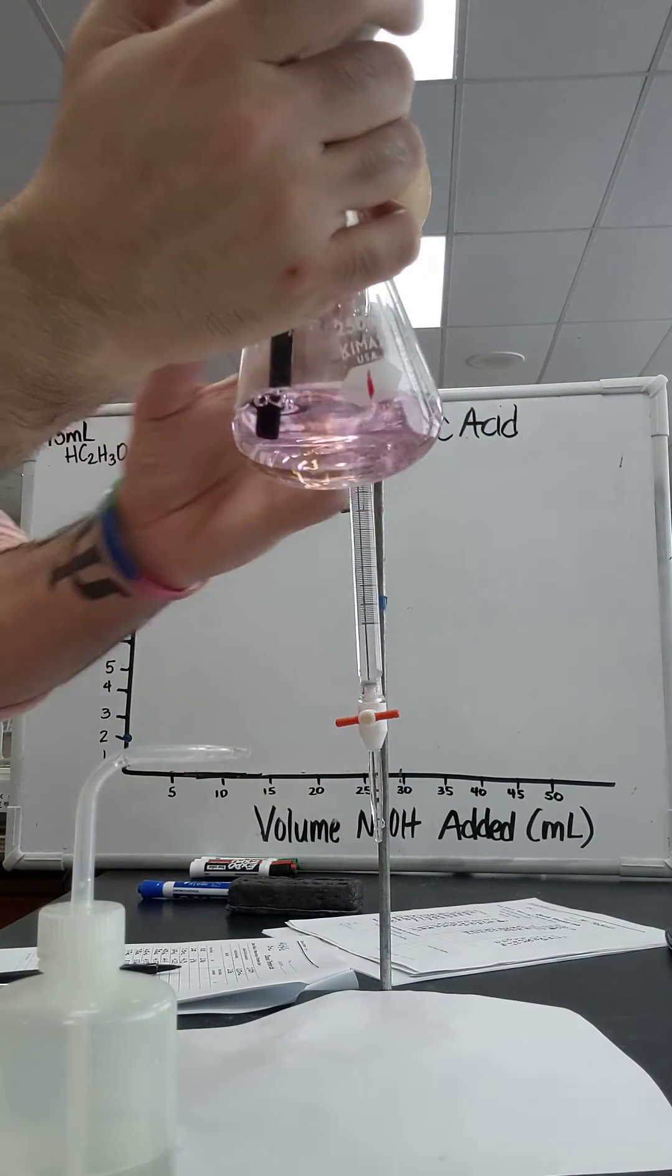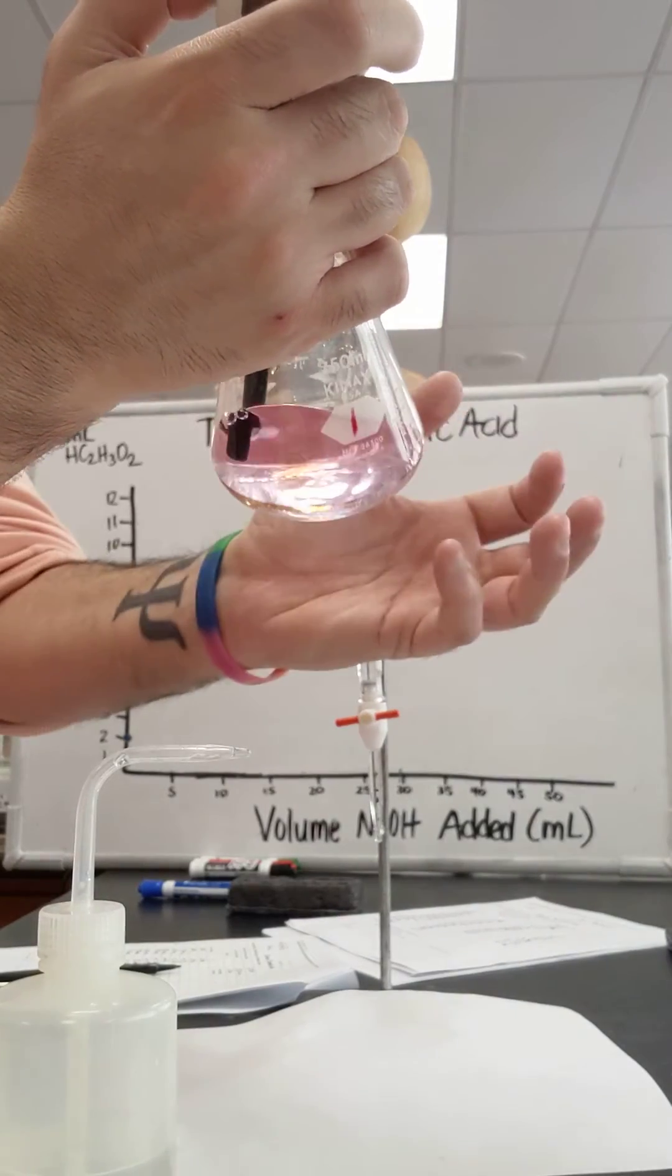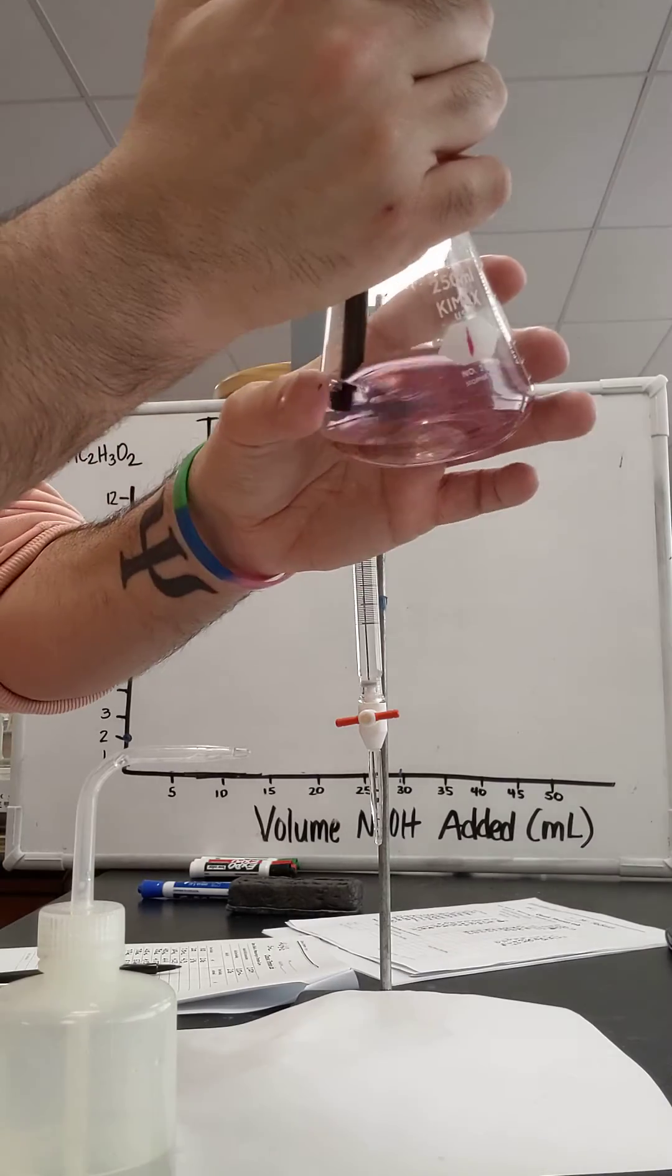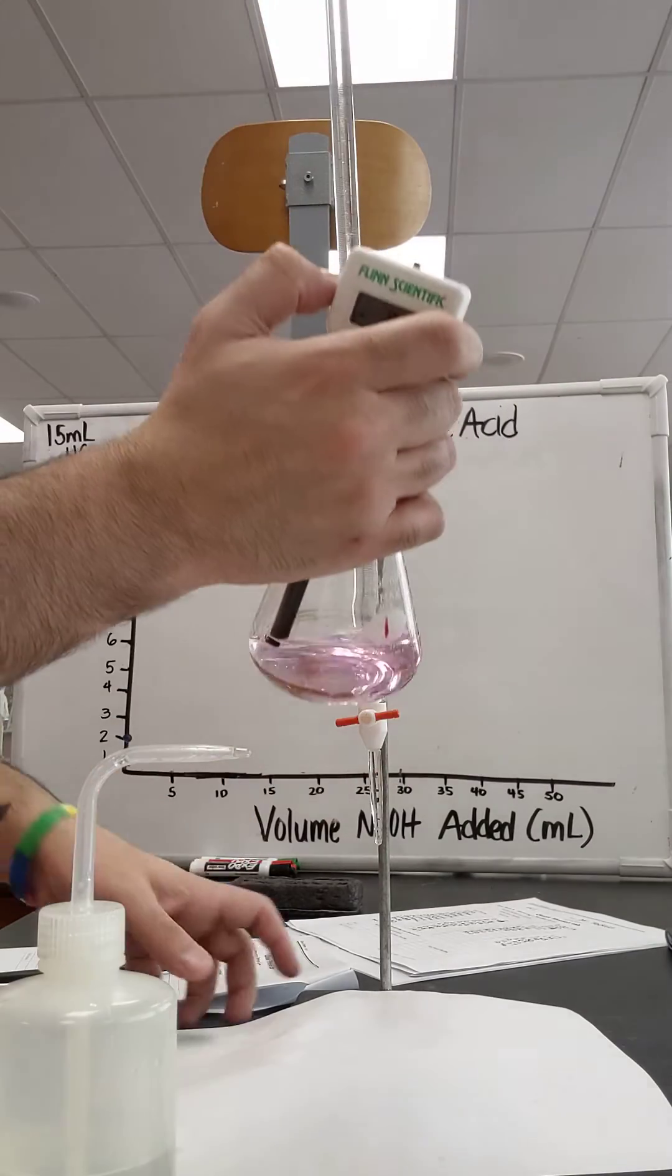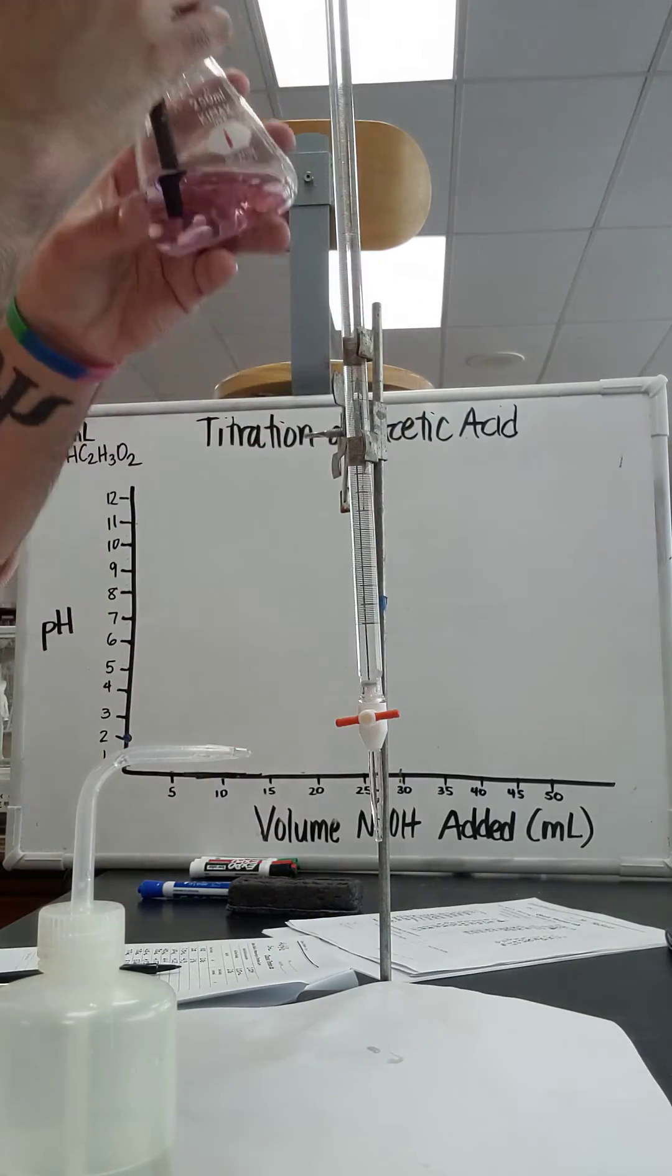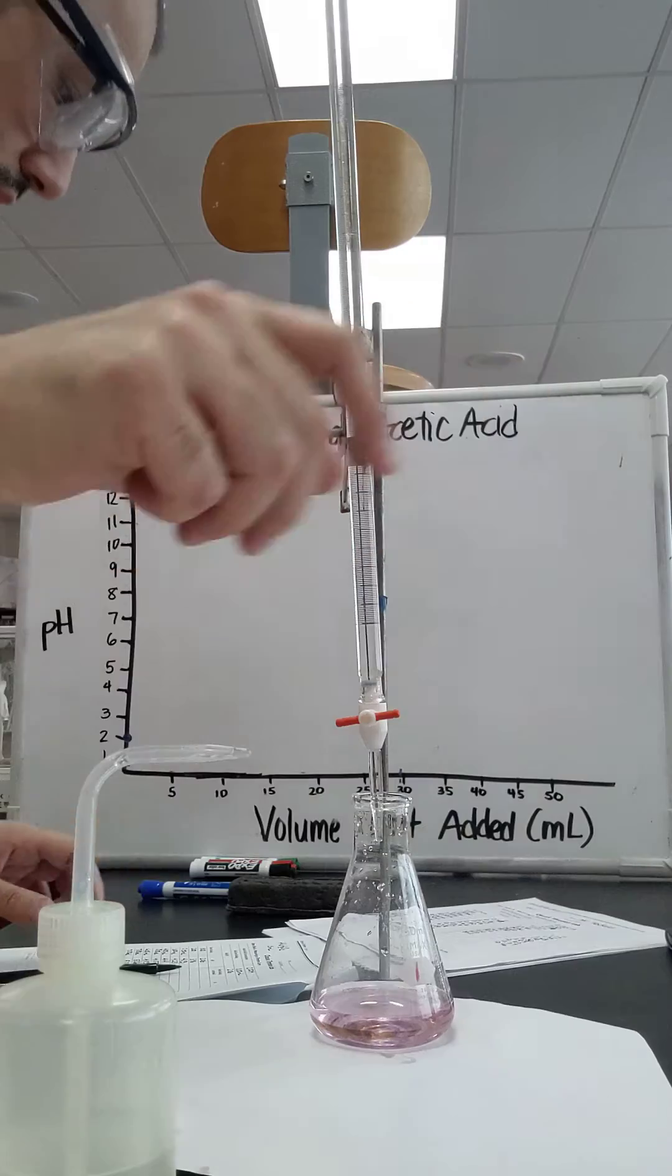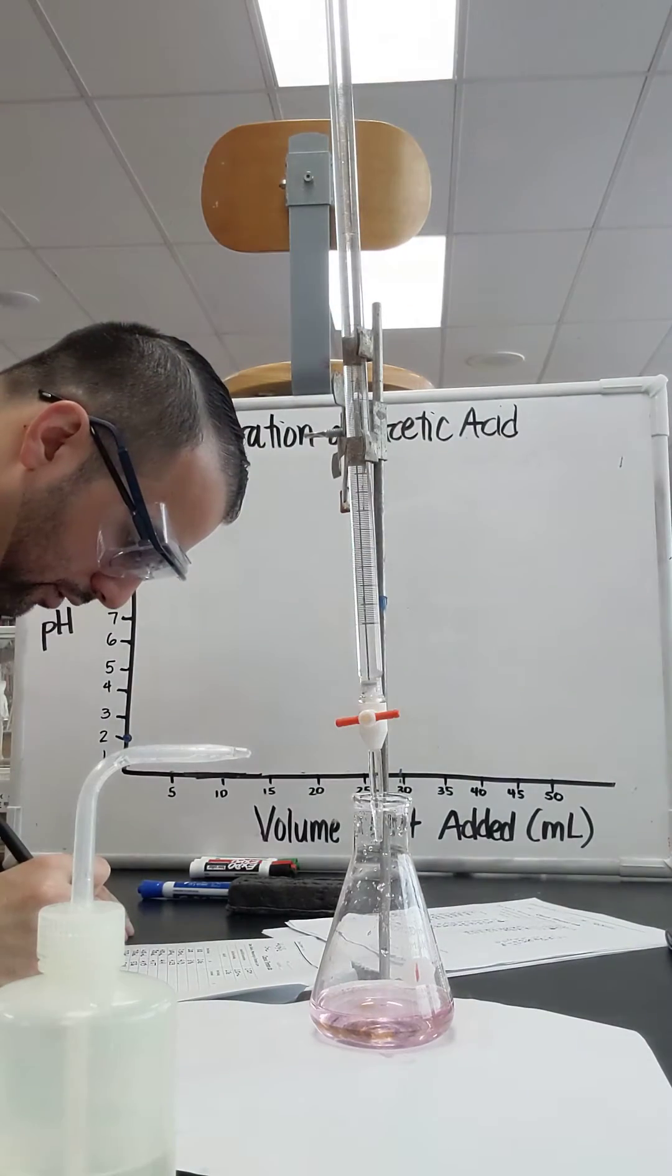So there's some equilibrium reaction happening in here where the base is reacting and it's going back and forth. And I'm making acid, using up acid, making acid, using up acid. And the color is fading. That's a nice pink color. And now my pH is at about 8.05 after 9 milliliters. I did jump a bit.